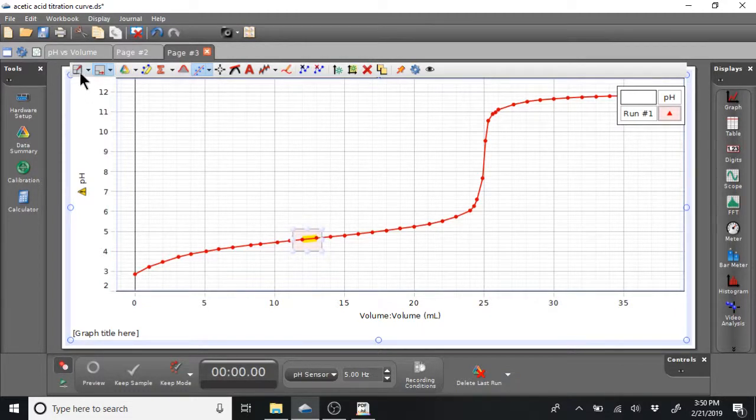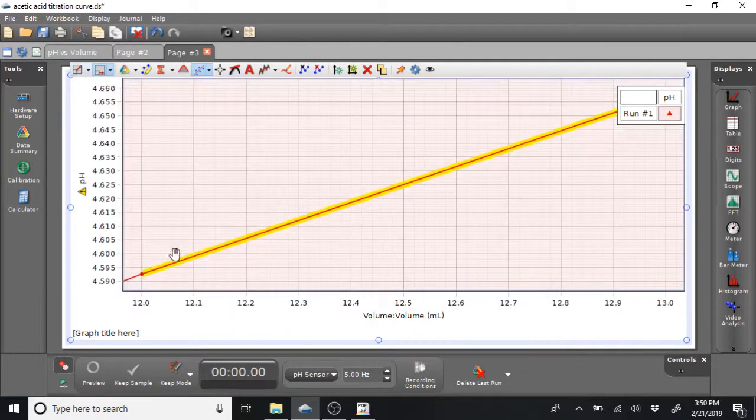Now I can click Expand again. And there I have what I need. Okay, so I've got 3 graphs. I can go ahead and print those 3 graphs out. I also took away the table and the digits from this, which makes it look nicer.